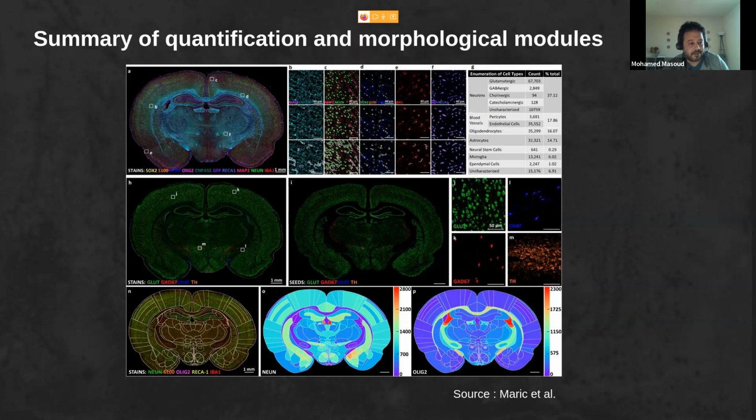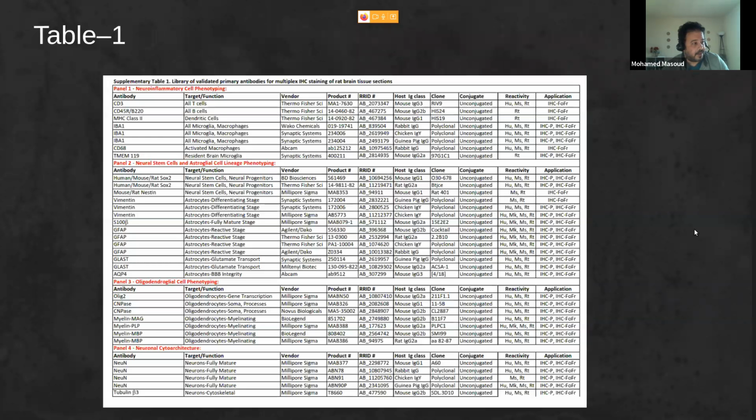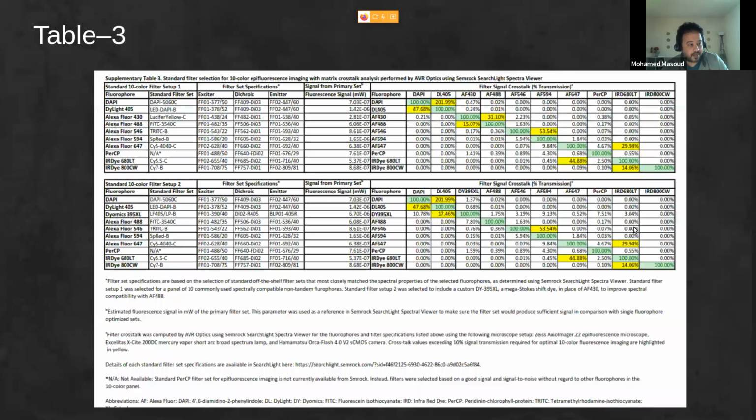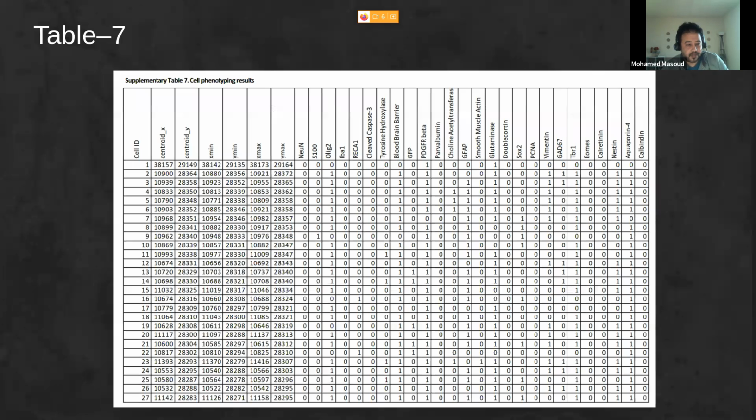They also gave a table showing the different markers they used and their association with different cell types. And we can go particularly to table number 7, which shows how they report the final results according to their protocol.